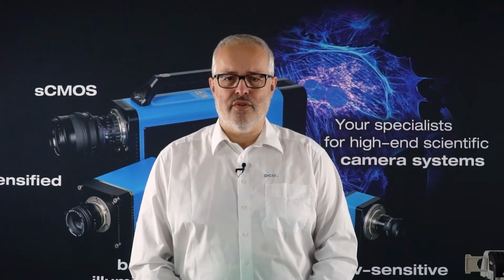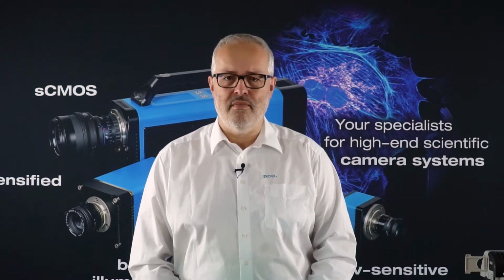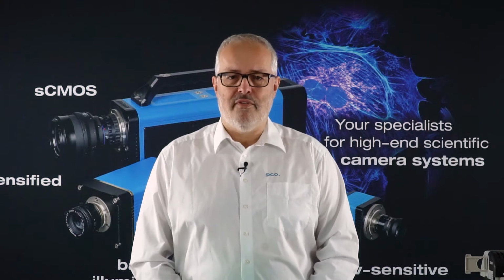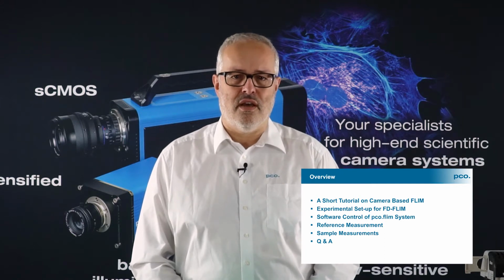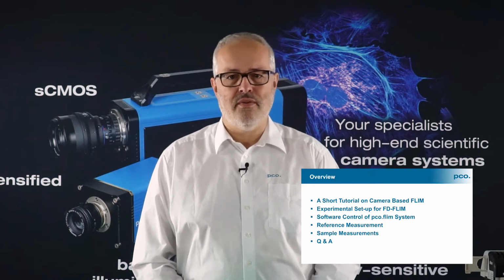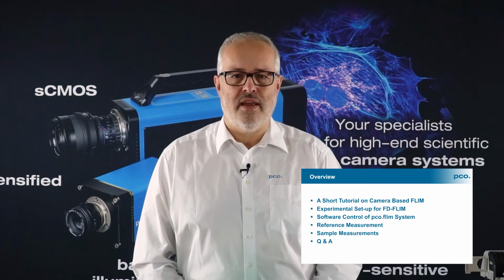Today I would like to show you how simple it is with our frequency domain Fluorescence Lifetime Imaging system, PCO FLIM, how simple it is to do FLIM measurements. But before I explain the experimental setup to you, I first would like to refresh your knowledge and your memories about the differences between time domain and frequency domain fluorescence lifetime imaging. Therefore, I would like to show you a short video tutorial that we have created to explain these differences.